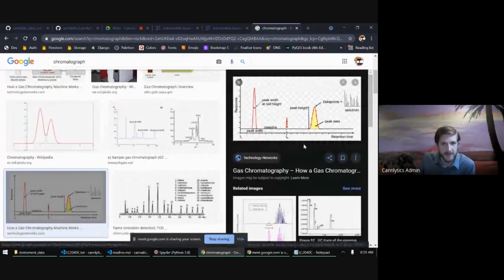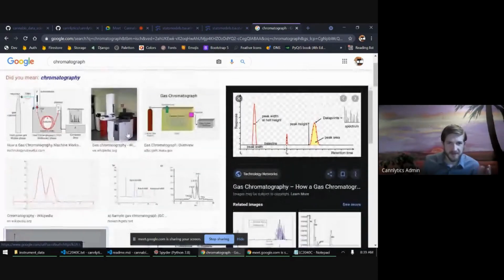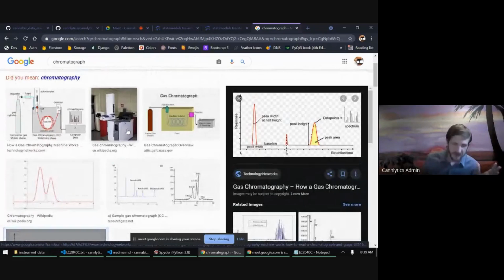Essentially, you're running the analysis on an HPLC or another scientific instrument that does chromatography.